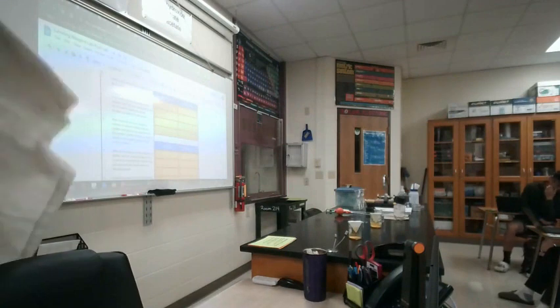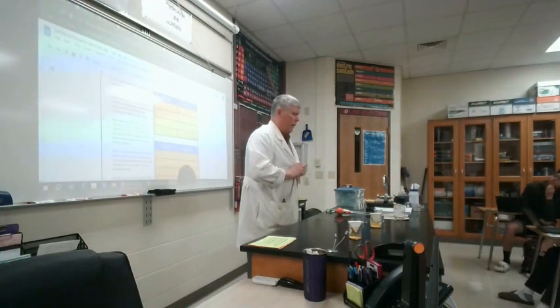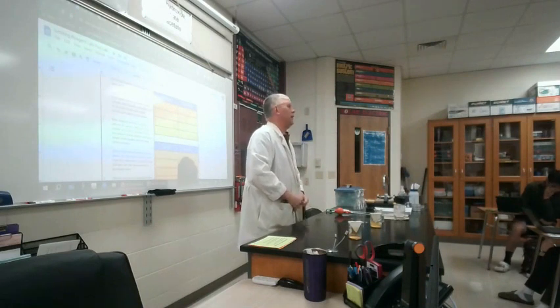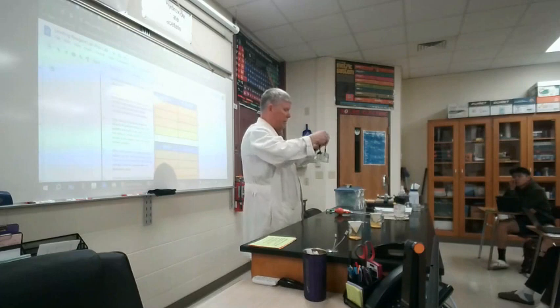let's practice good lab behavior, including lab safety, ladies and gentlemen. The way it works, ladies and gentlemen, the green bulb goes in the one with the green writing on it. Okay? That is the only place you put it other than back on the paper towel.